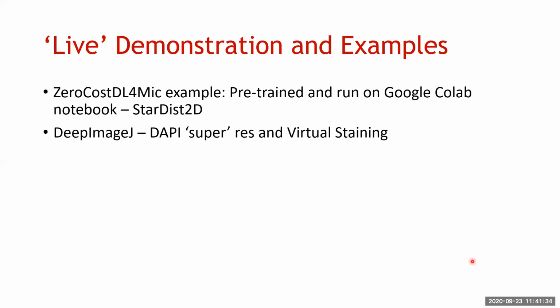When you do training, there's always a step in which you evaluate how the model went, and there are plots that show errors and things like that, to show whether or not there are any unfair biases involved. So there are steps that should be included, or are included if this is written correctly, that make sure that you have an accurate model. So there are fail safes and safeguards in place if it's all written correctly.